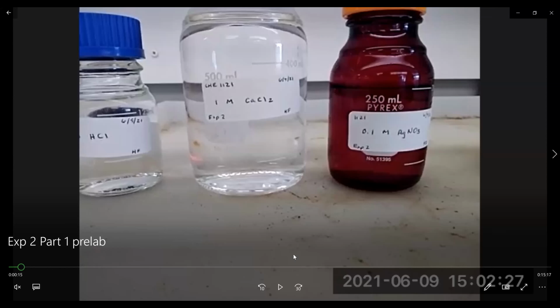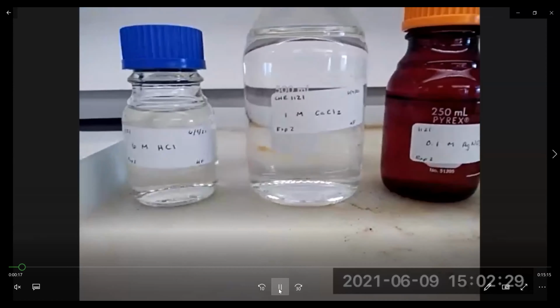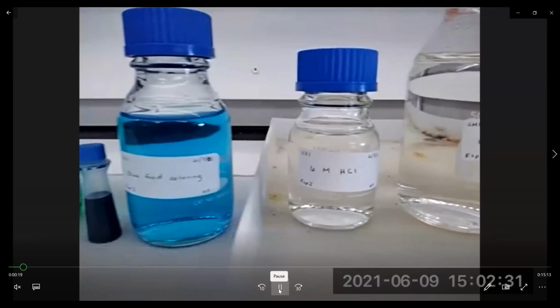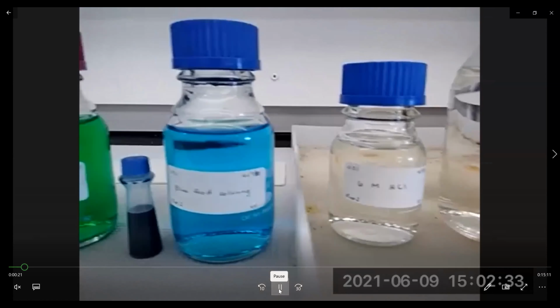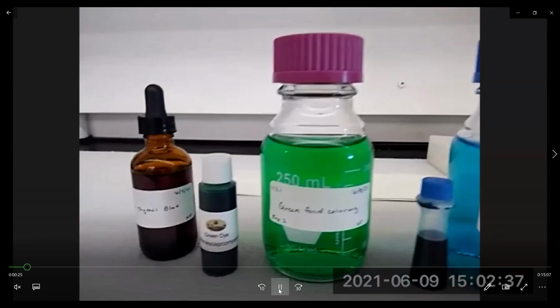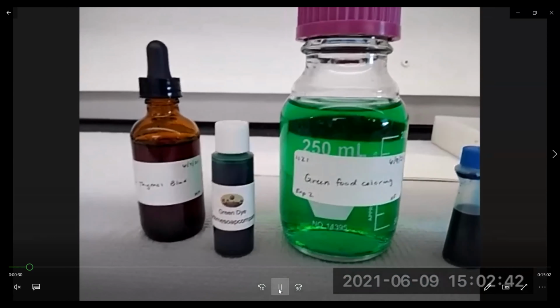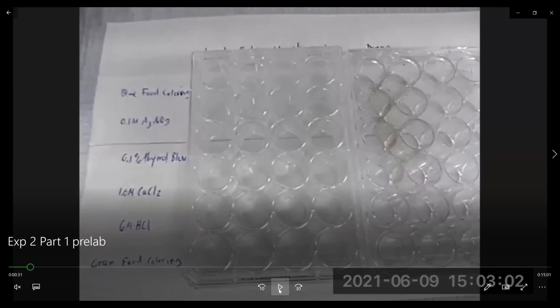And here are the reagents we'll be using to react with the household chemicals. So we're going to be using silver nitrate solution, calcium chloride solution, hydrochloric acid, blue food coloring, green food coloring, and Thymol Blue acid base indicator. Now, Thymol Blue is an acid base indicator.